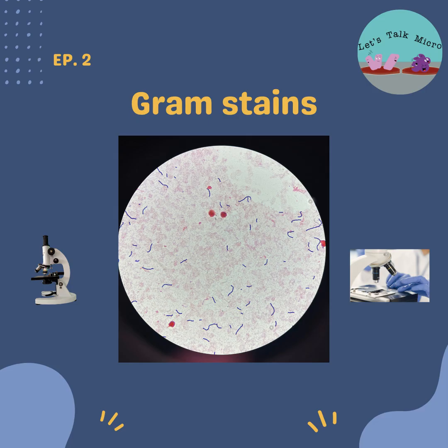And what the iodine does is, you apply it after your crystal violet, and it chemically bonds the alkaline dye of your crystal violet to the iodine. So it's like a fixative. It just fixes that purple stain. And then you have your decolorizer, which is an alcohol. And this is what distinguishes the gram positive and gram negative bacteria. So when you decolorize a gram positive bacteria, if you do it properly, of course, your organism retains the crystal violet and it exhibits a purple color. If it's gram negative, the organism will lose that crystal violet and then it retains the counter stain, exhibiting a pink color.